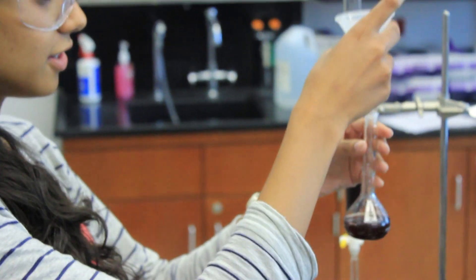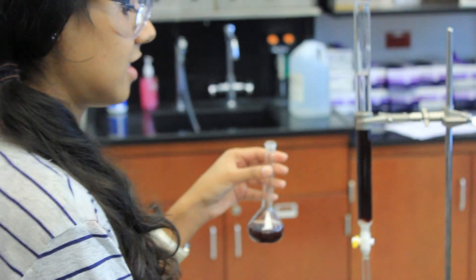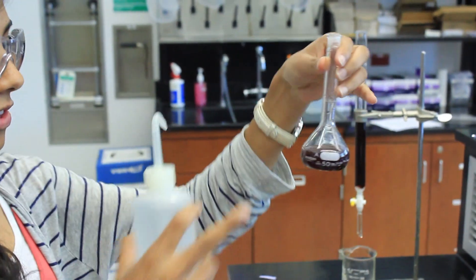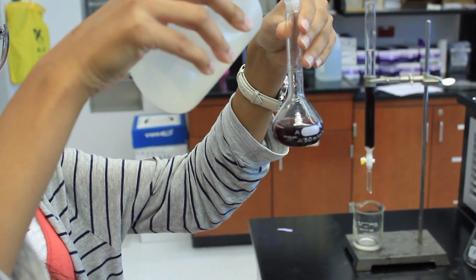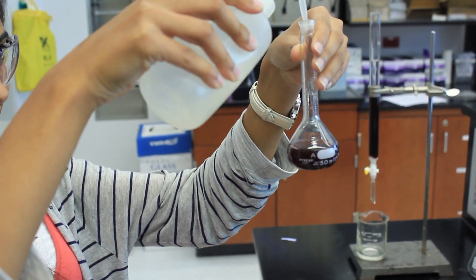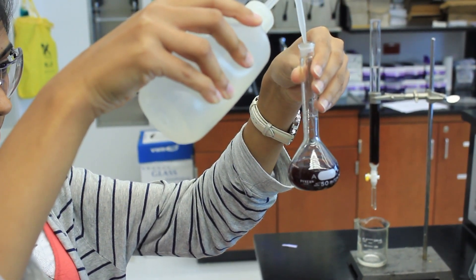Then you're going to take your funnel out and dilute it up to the 50 milliliter mark right there. So just take your squirting bottle and keep pouring it until it gets all the way up there.